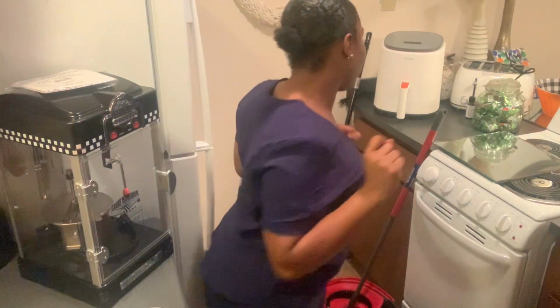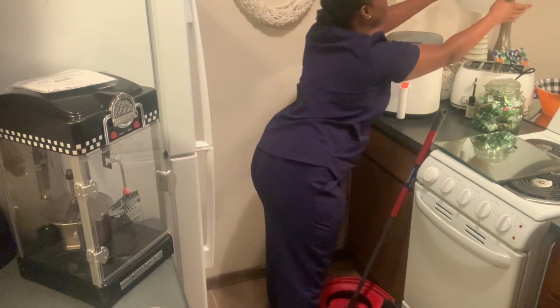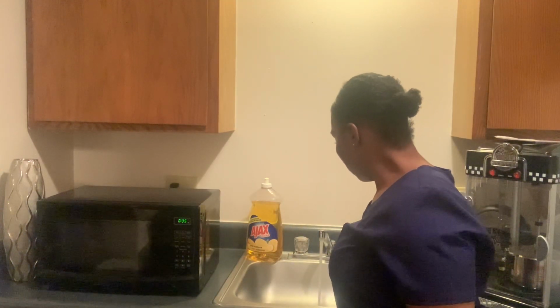Now we have to wash our hands. So the next step is aseptic technique. I'm going to wash my hands. I'm going to get a paper towel, and then we're going to turn on the faucet with this paper towel. We always have to make sure that the water is lukewarm.